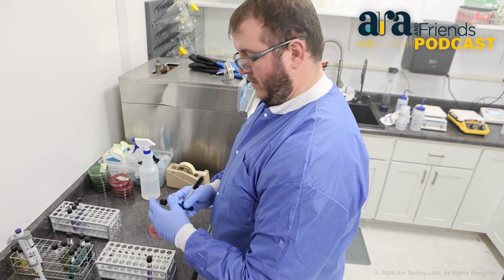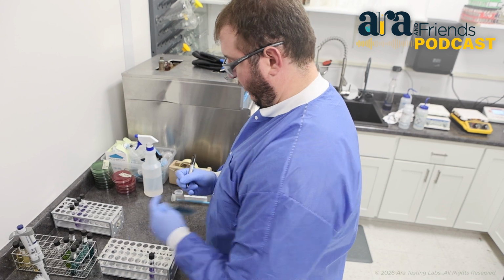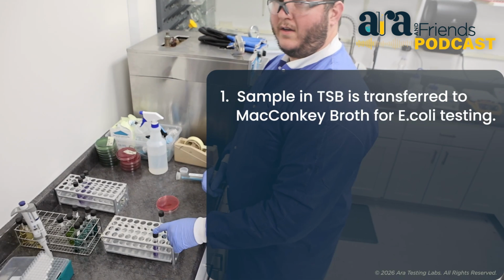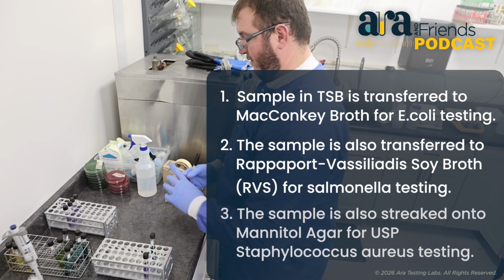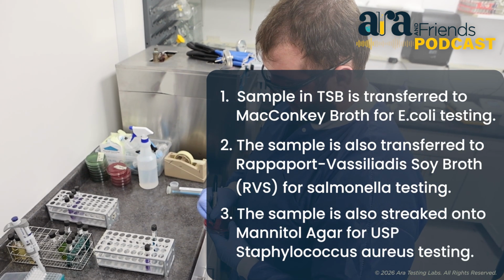This sample was incubated overnight in TSB, and now we're going to transfer it to MacConkey broth to do the USP E. coli test, and to RVS broth, which is USP Salmonella. We're going to streak it on mannitol, and that's USP Staph. So that's what we're going to do right now.